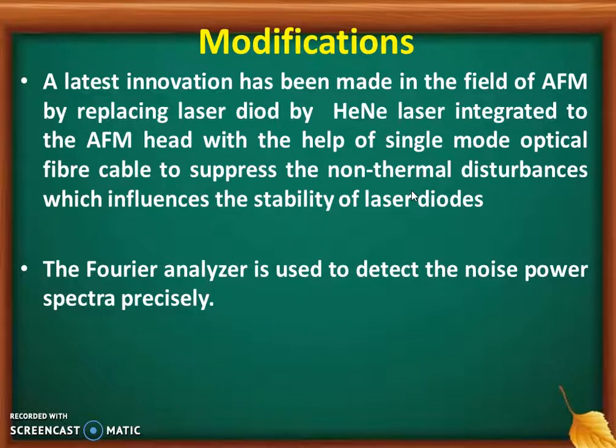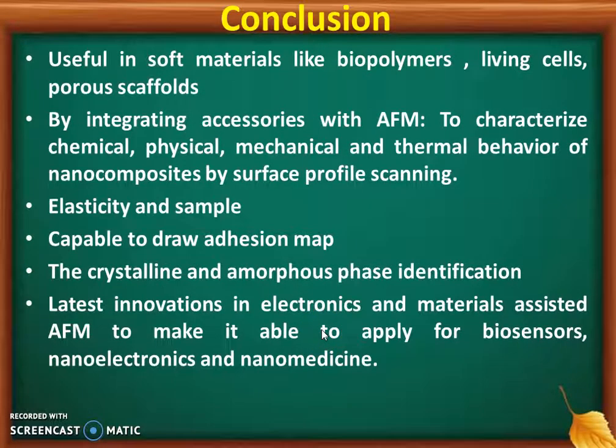A latest innovation has been made in the field of AFM by replacing the conventional laser diode with a helium neon laser, integrated to the AFM head with the help of a single mode optical fiber cable, to suppress the non-thermal disturbances which influence the stability of laser diodes. A Fourier analyzer is used to detect the noise power spectra precisely. We will see the conclusion.